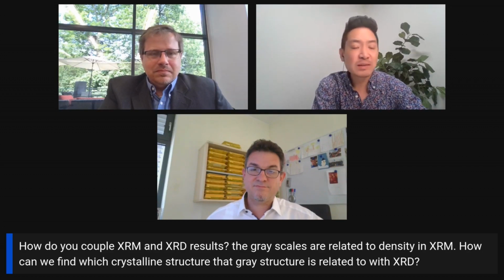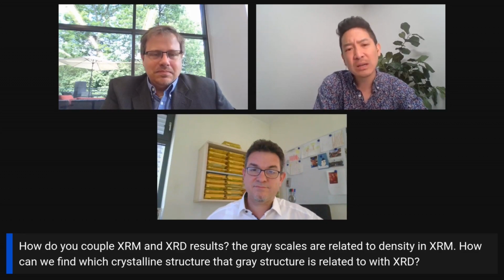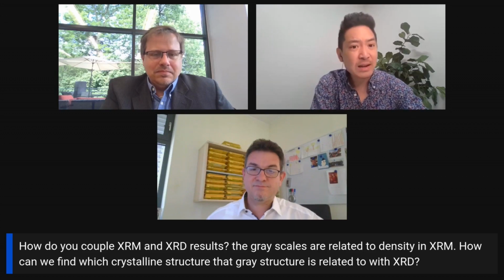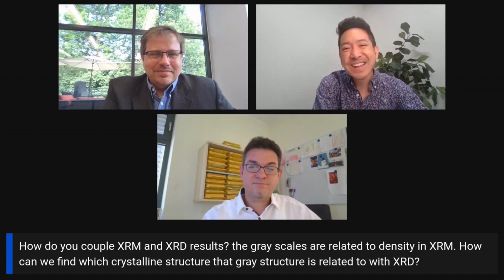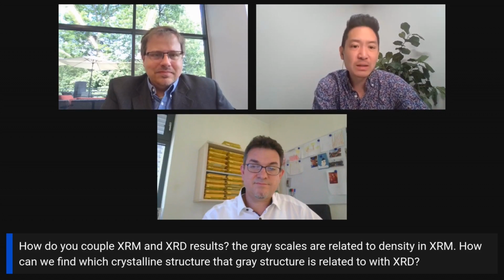You could try doing things like selective dissolving and recrystallization, but I think it's often the case that we aren't fully trying to solve an unknown. Particularly with formulated products, it's not, I have no idea. I mean, there's so much paperwork, right? There are safety data sheets, there are drug disclosures. You often know what is in there. You're just trying to figure out exactly, can I confirm it, rather than what is this peak?